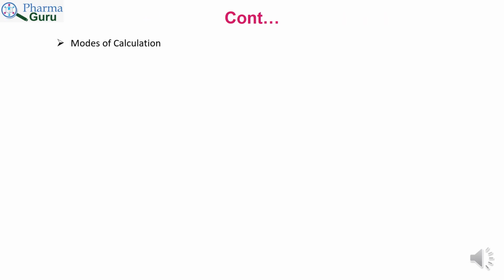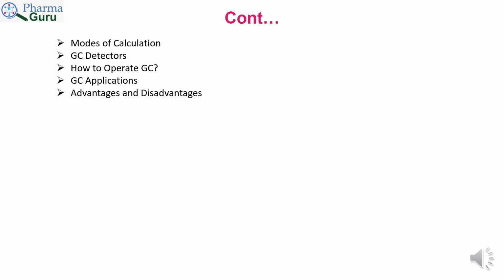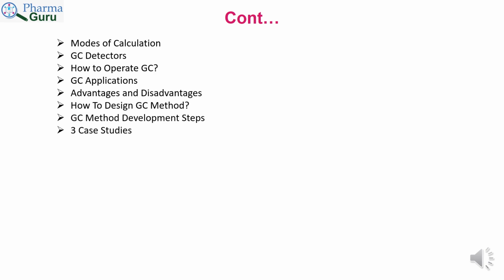modes of calculation, GC detectors, how to operate GC, GC applications, advantages and disadvantages of GC, how to design GC method, GC method development steps, case studies, top interview questions asked on GC.